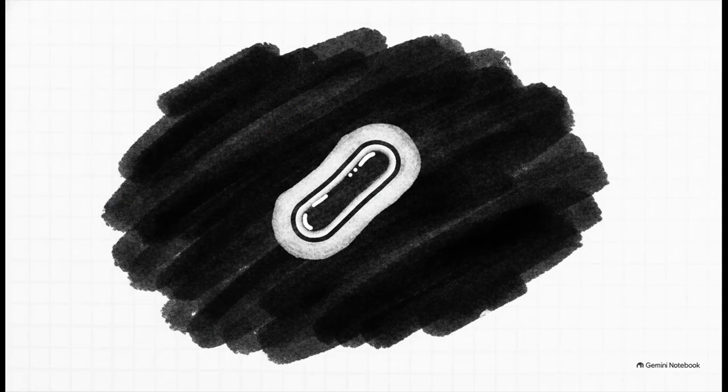Then there's the fascinating reverse psychology approach of negative staining. Sometimes trying to stain the organism itself just doesn't work, especially if it has a capsule. A capsule is this slippery, sugar-rich external layer that perfectly protects the bacteria from our immune system. So instead of fighting it, we use India ink to paint the background completely black. The organism itself remains unstained, which reveals the clear, glowing halo of its dangerous capsule set dramatically against the dark background.